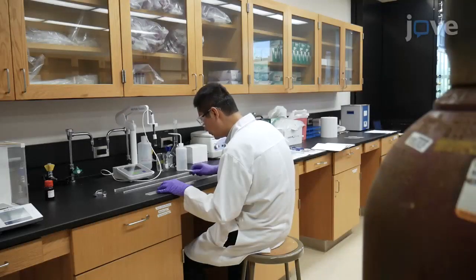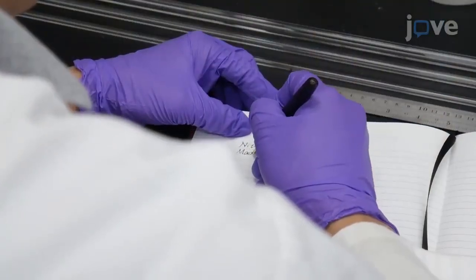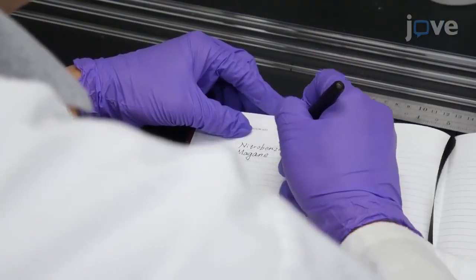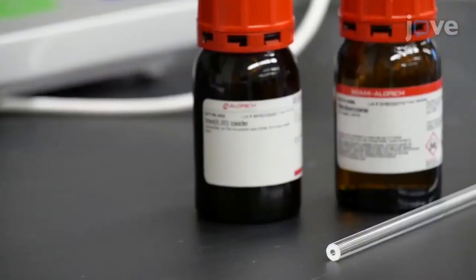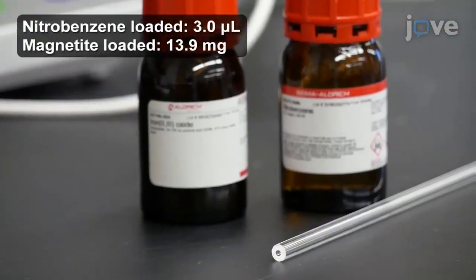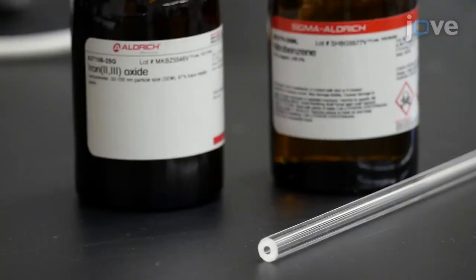To begin this procedure, choose a tube size and material, and determine the amounts of organic compounds and minerals to use, as outlined in the text protocol. This demonstration will be carried out using nitrobenzene and magnetite, loaded into a silica tube with an inner diameter of 2 mm and an outer diameter of 6 mm.